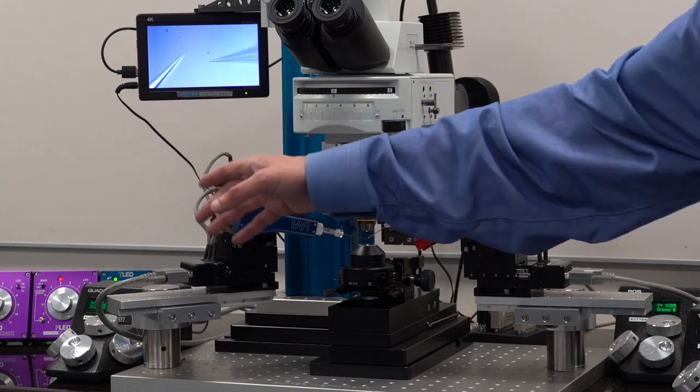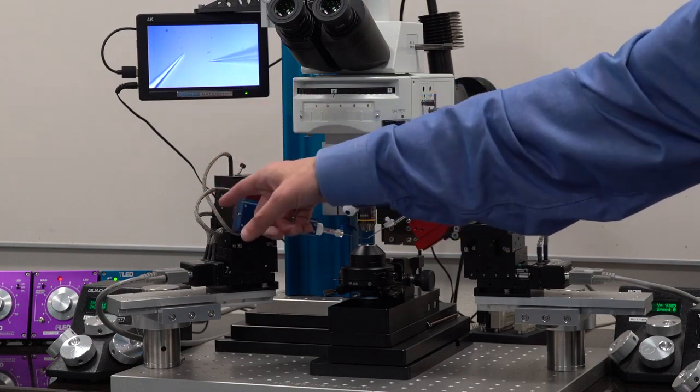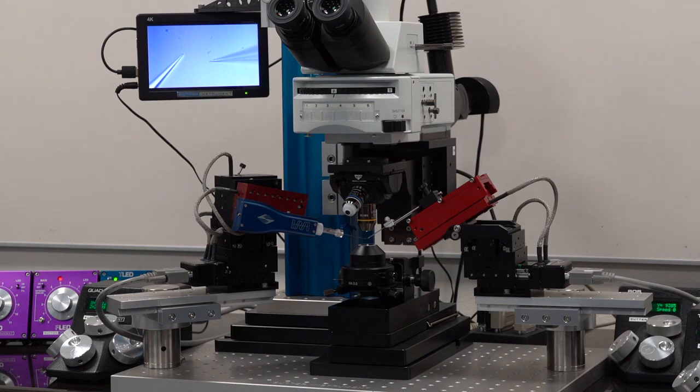On this side, I have, so we said, okay, so how can we make it less expansive? And we made the trio 235.